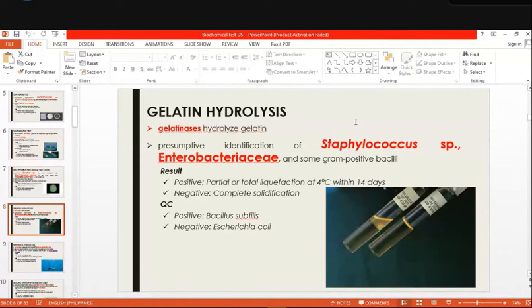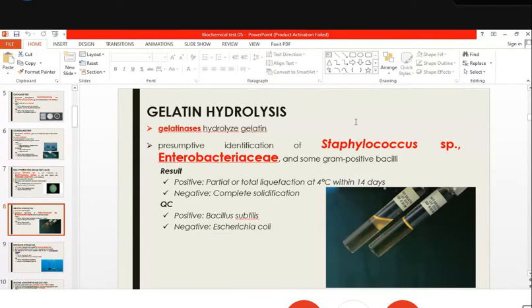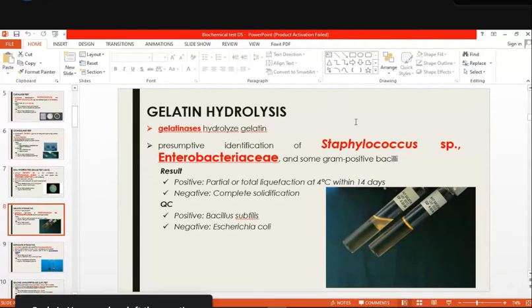How about our coagulase test? The result is the same whether the coagulase is free or bound: presence of a clot. The result cannot differ between free and bound, because you are still checking for the clotting mechanism of the coagulase enzyme. Catalase, what is the result? Bubbling.